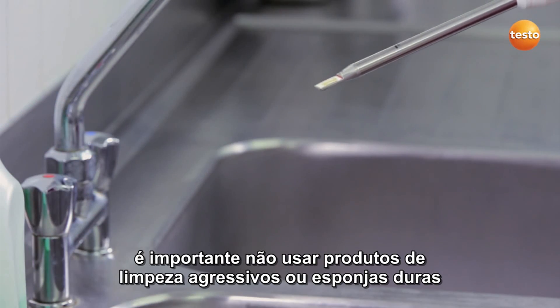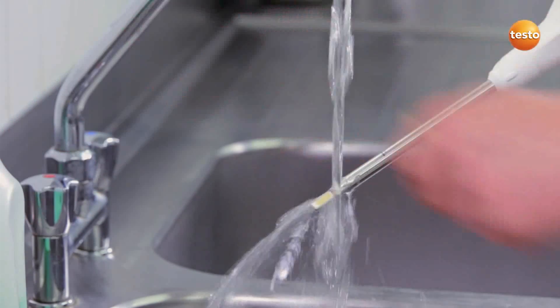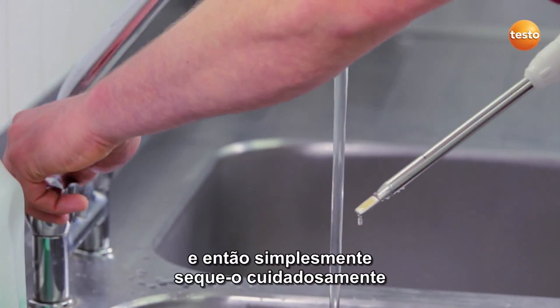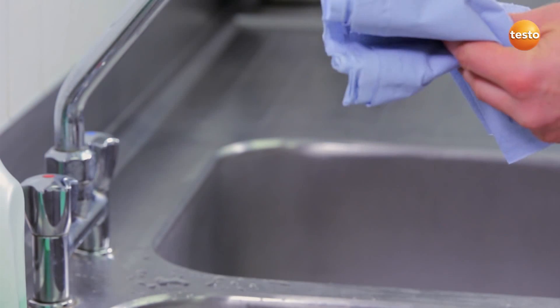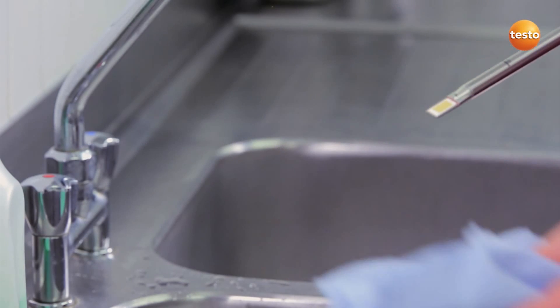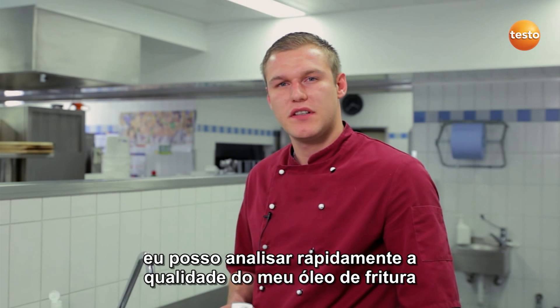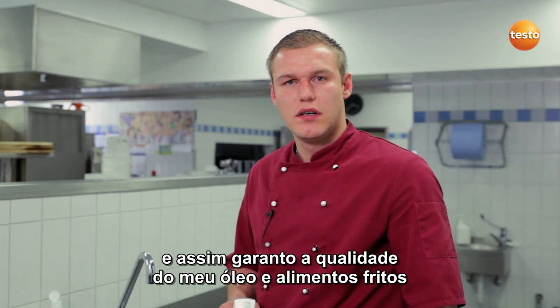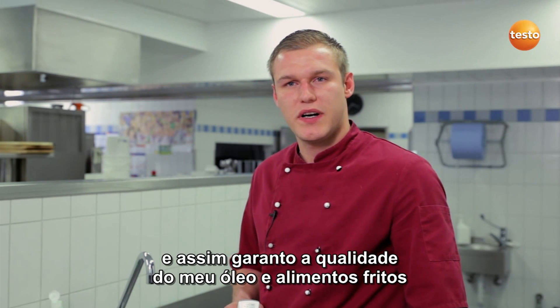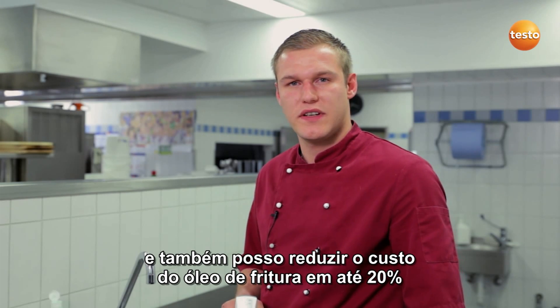It's important not to use any aggressive cleaning products or abrasive sponges. And then simply dry it off carefully with a soft paper towel. Done! As you can see, with the Testo 270, I can very quickly determine the quality of my cooking oil. I adhere to the TPM limit values, ensure the quality of my oil and the deep-fried foods, and on top of that, I can reduce my expenses for cooking oil by up to 20%.